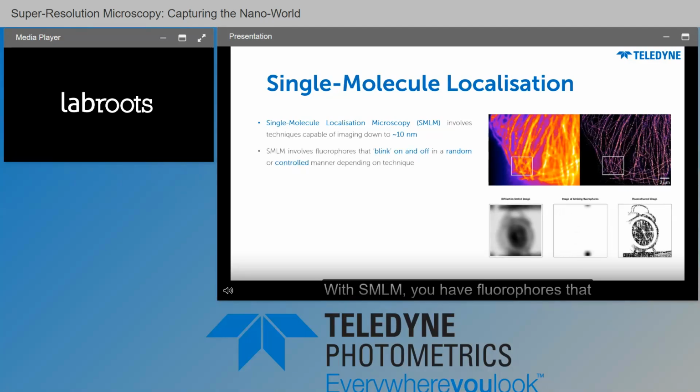With SMLM, you have fluorophores that blink on and off in a random or controlled manner depending on the technique. So you can see here a diffraction limited image of an alarm clock, and what you're imaging is blinking fluorophores. You can localize exactly where these fluorophores are, and then you can build up an image from every single point within it, as you can see in the reconstruction.